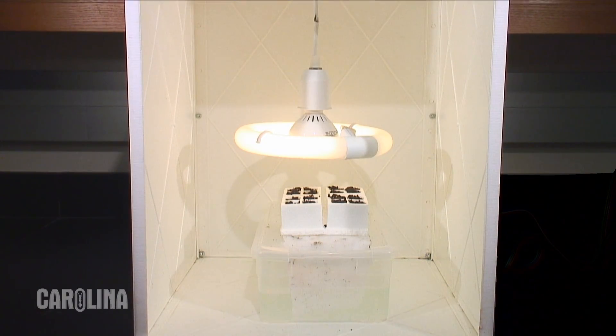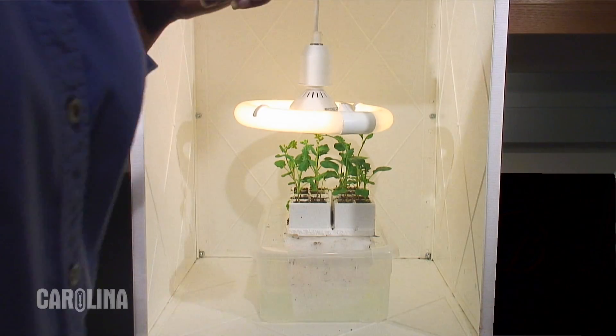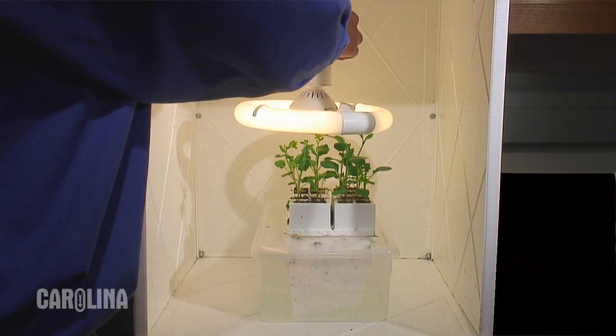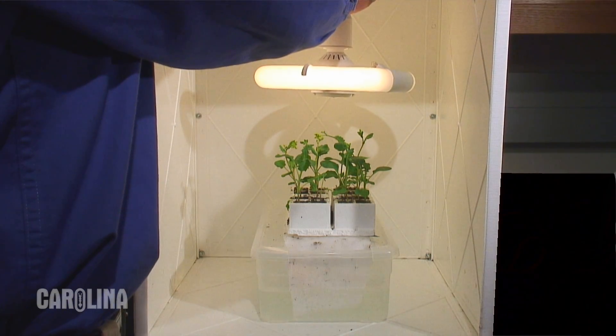Leave the lights on 24 hours a day, seven days a week, until they produce mature seed pods. Lights should remain five to eight centimeters above the plants, so adjust them upwards as the plant grows.